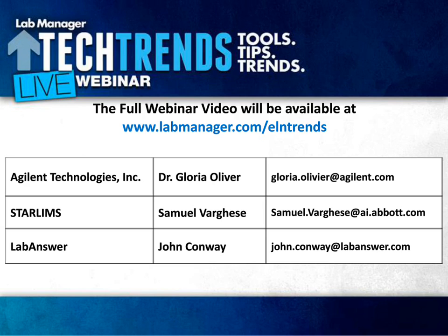Thank you, Sam. Yeah, so our ELN is built on the STARLIMS LIMS platform, and the ELN is an add-in. It would run on either a SQL Server or an Oracle database with a Windows server backend, and then it's scalable depending on the volume of tests and samples going through a particular lab. It would scale up accordingly. If it's a smaller lab, you would need smaller data requirements. If it's a larger lab having thousands and thousands of samples going through, you would need a larger amount of data.